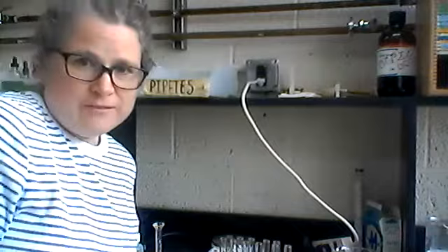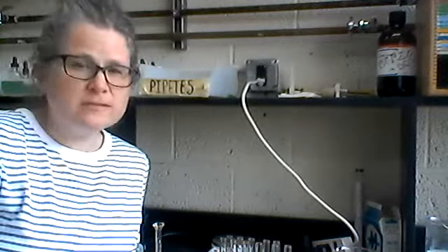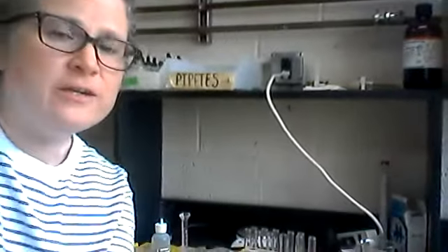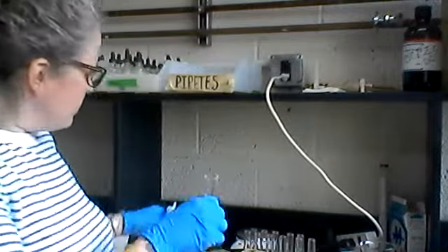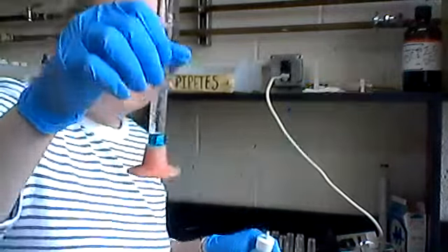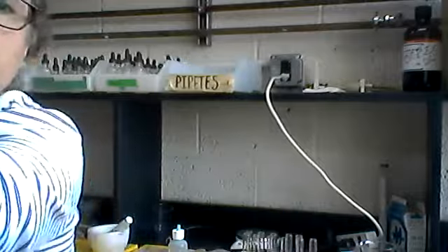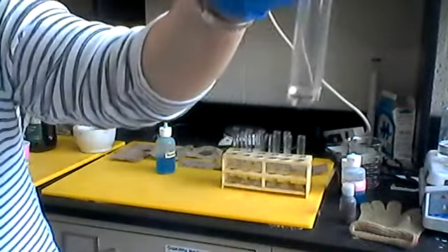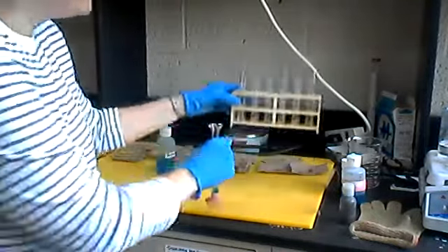Now I'm jumping ahead of Benedict's reagent, which is in your lab manual first, because this takes about 10 minutes in this hot water bath. So I'm going to get that started, and then I can do the Benedict's while it's kind of cooking away. So all I'm going to do is I took this Barfoed's reagent, I measured out 2 milliliters of it, and I'm just going to add 2 milliliters to each of these test tubes. Now I've gone through already and put 1 milliliter of each of the substances into these different test tubes.